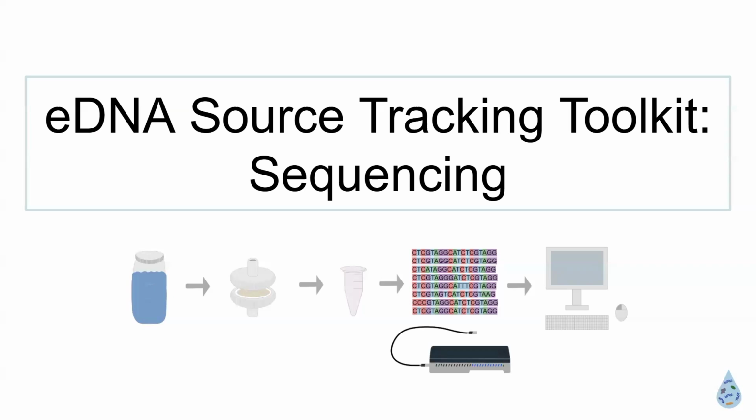When collecting the water samples, did you have any specific strategies or places where you collected them? If it's a site where I can easily reach the water, I would just make sure I was gloved up and put the carboy in the water. It's sterilized before you sample, but you still want to shake out the first few times you fill it, to wash it out with the sample water that you're going to fill it with.